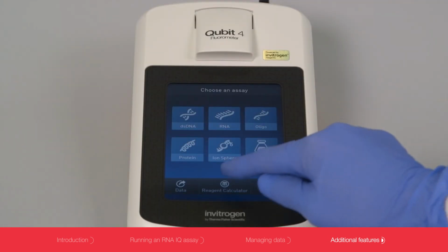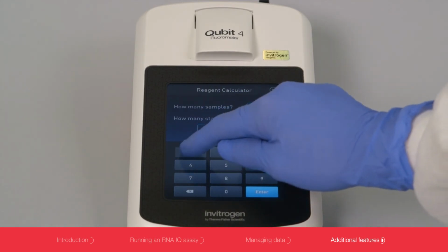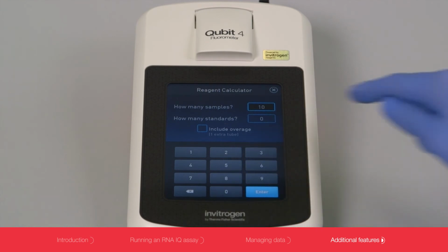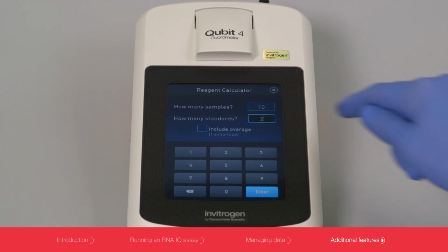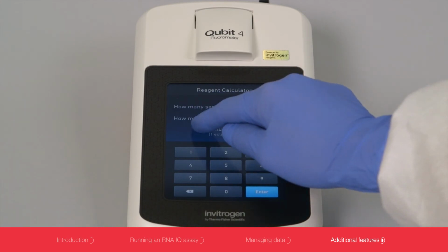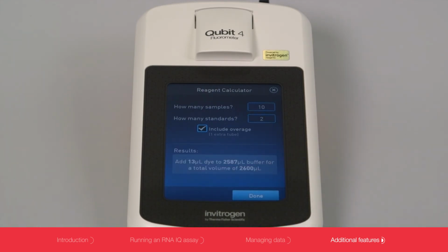From the home screen, you can access the Reagent Calculator. The Qubit 4 fluorometer Reagent Calculator calculates the amount of dye and buffer required. First, enter the total amount of samples. If you are running standards, enter the number of standards. If you select Includes Overage, the Reagent Calculator will include the amount of dye and buffer required for an additional sample to ensure you have enough solution prepared.